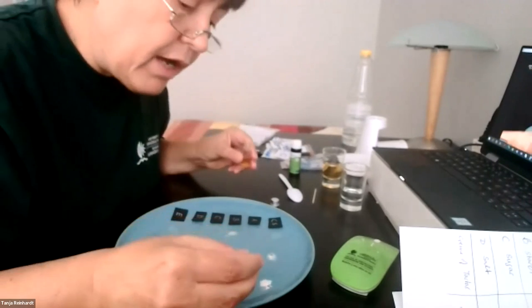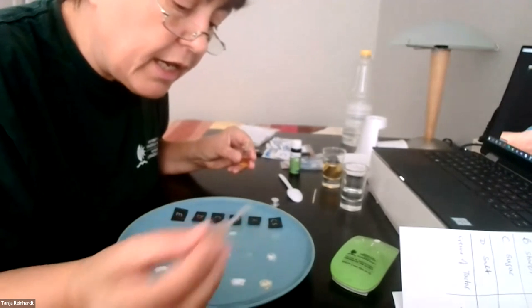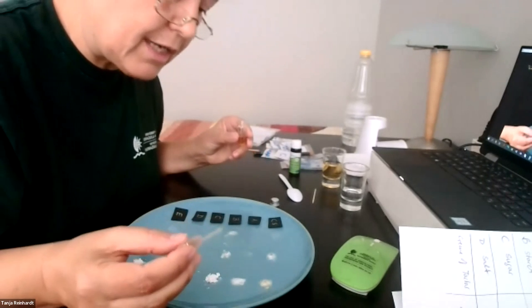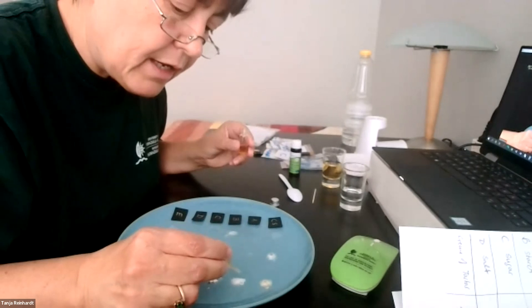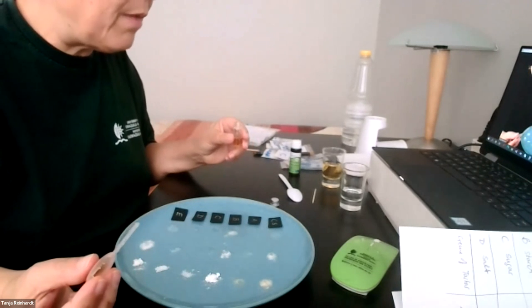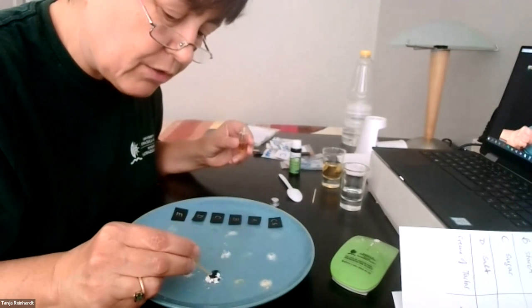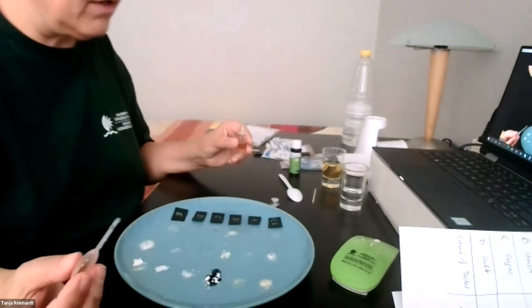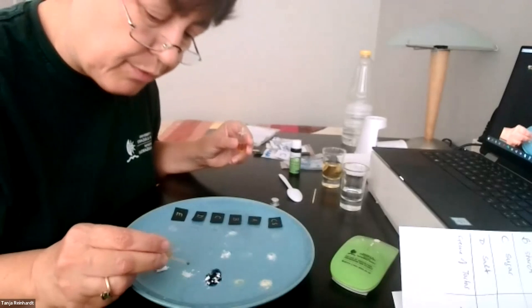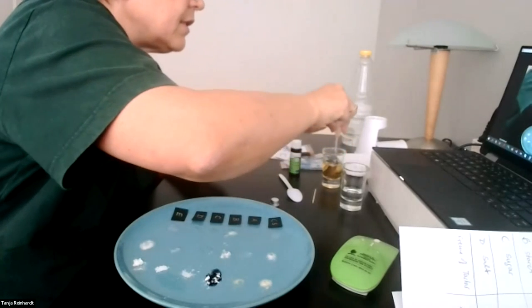So with our crime scene powder, I'm gonna add 2 drops and it doesn't really change color. So it's still this kind of yellowy color. And with A, also not much happening. Doesn't change color as well. Let's see what B does. Oopsie, here we go. Now this is what I call a color. So here we've got a nice dark blue color. And I'll just have to rinse it.